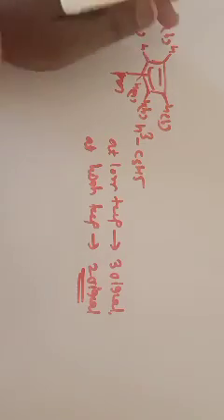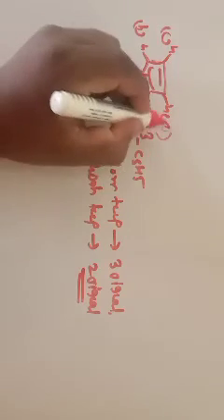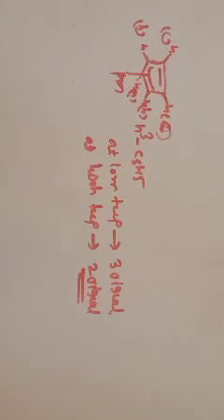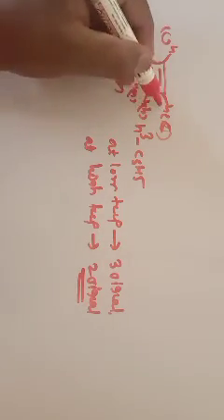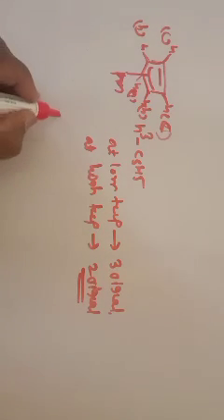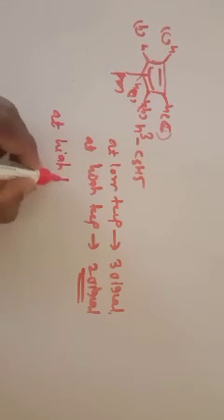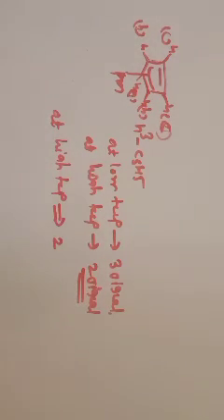This is your C, not B, this is your C. So there is a rapid exchange of these B and C types of protons. So the NMR instrument cannot detect this interconversion, and therefore, because of the rapid conversion of these B and C protons, we get only one peak, and for the A type of proton we get only one peak. So at high temperature we get only 2 signals. We already discussed that at high temperature we get only 2 signals.